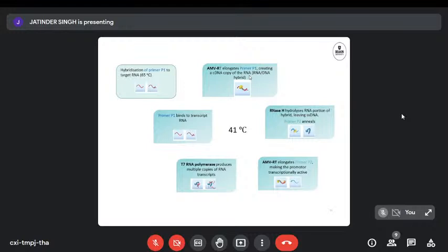And we can't do that as a one-pot mixture because the enzymes here, RNase H, T7 RNA polymerase, and AMV RT, are not stable at 65 degrees Celsius, where we need to do the annealing. So that heating step is taking away the potential of NASBA for integration in microfluidic systems, because we'd need an additional fluidic handling step to first anneal the primer, and then introduce it to the reagents to start amplification at 41 degrees Celsius.